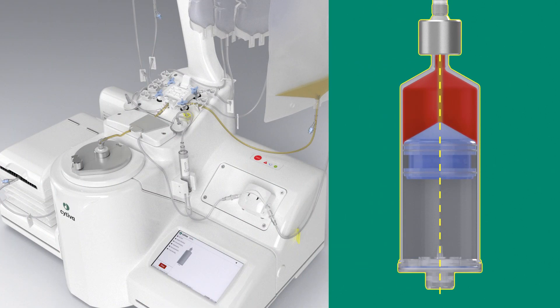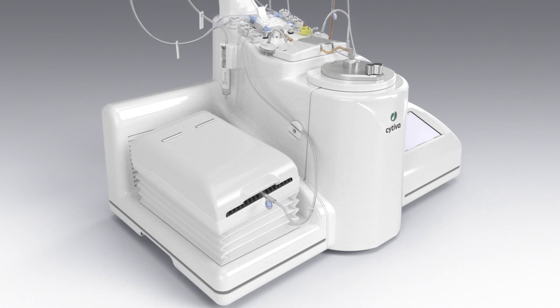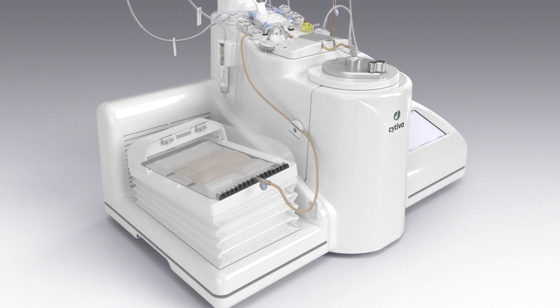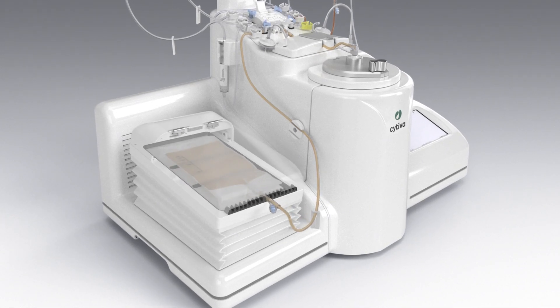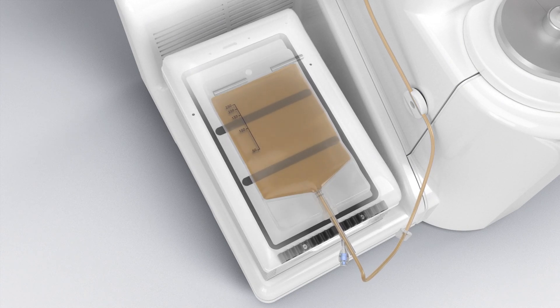The supernatant, located along the spinning axis of the separation chamber, extracts into the waste bag. At the end of the procedure, the system extracts the cells into the final bag. You can formulate the final product using the thermal mixer.